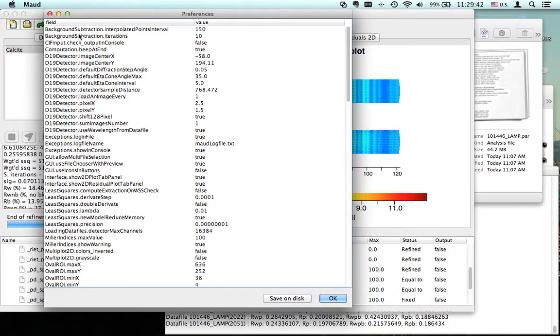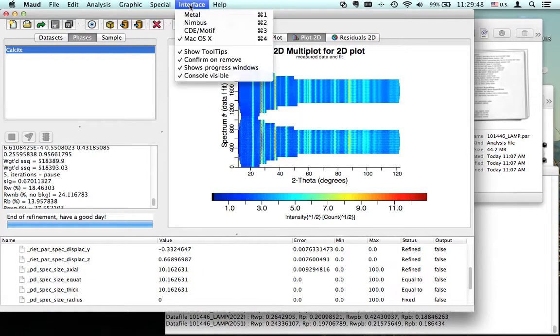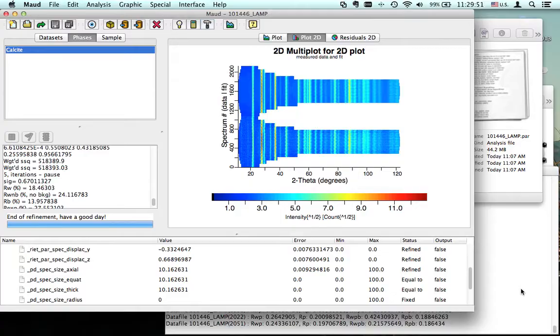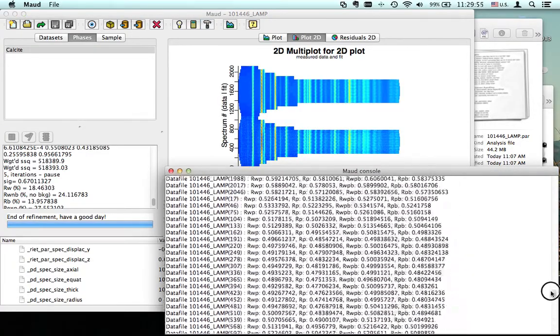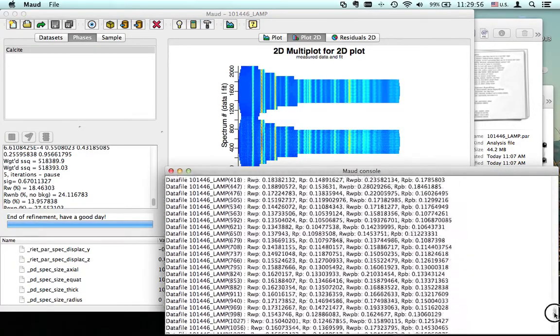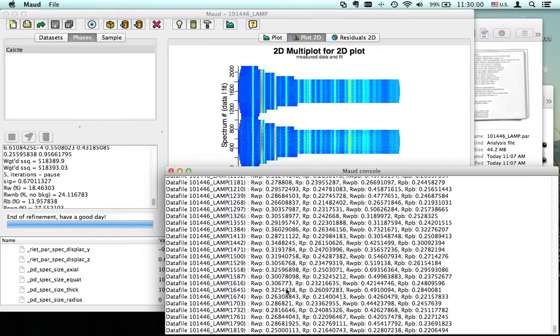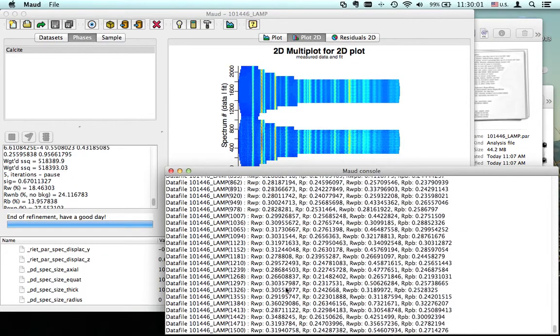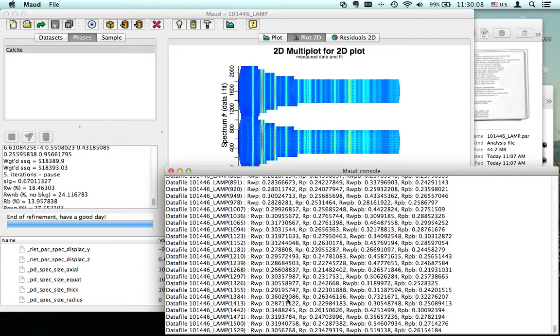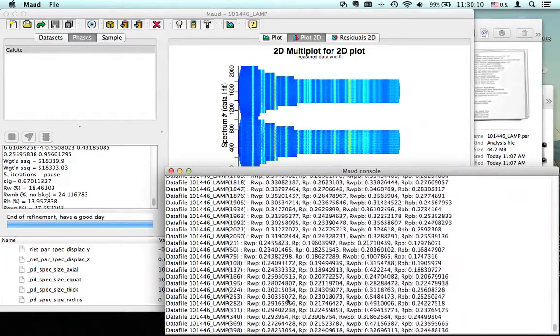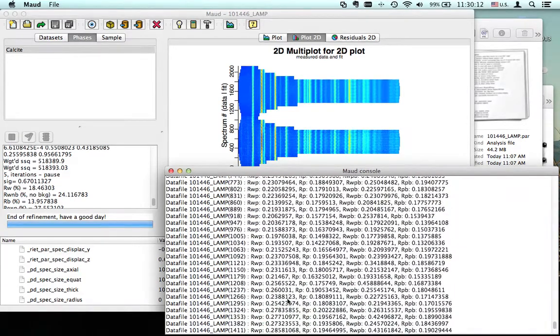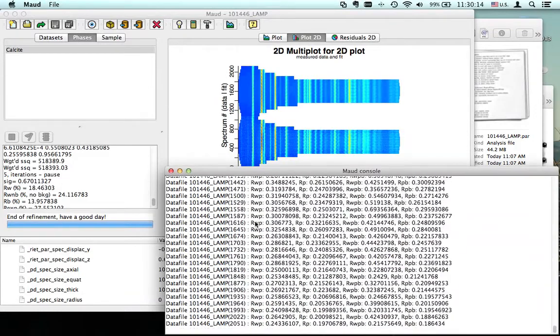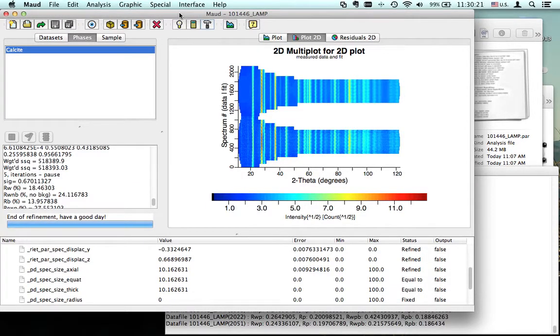In the console, there's also all the RWP for every pattern, so you can check each one and see if there are some which may be, like this one, a little bit higher. You can check which one is working less or more.